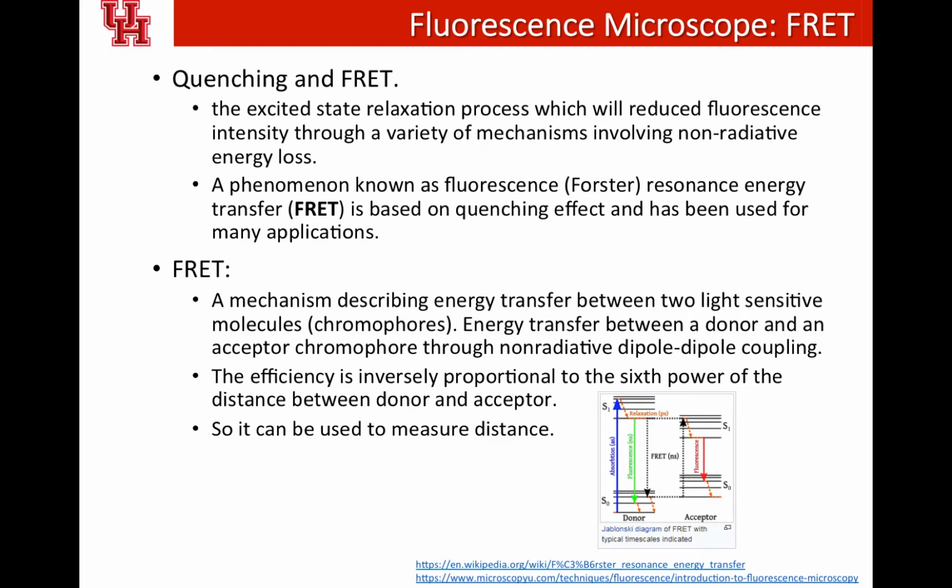However, maybe through thermal vibration, it will release this energy to a vibration mode. Instead of emitting green fluorescence light, it just loses energy non-radiatively through interaction with phonons, right? So this thermal vibration is one method, one problem. Quenching is always a problem. So people have utilized this quenching to design a new technique.